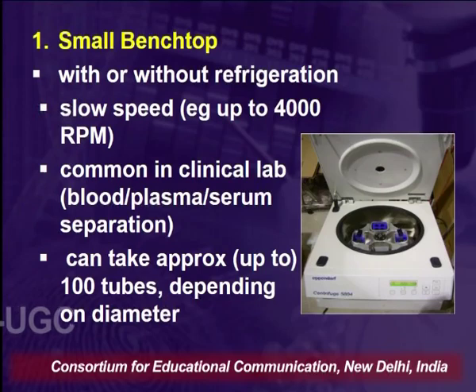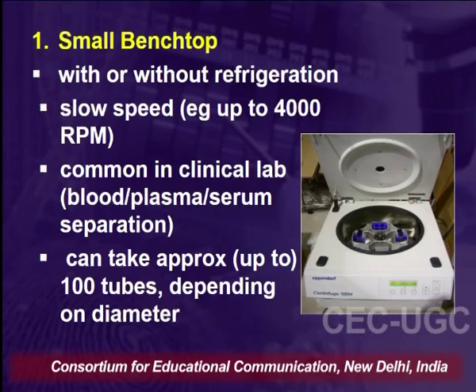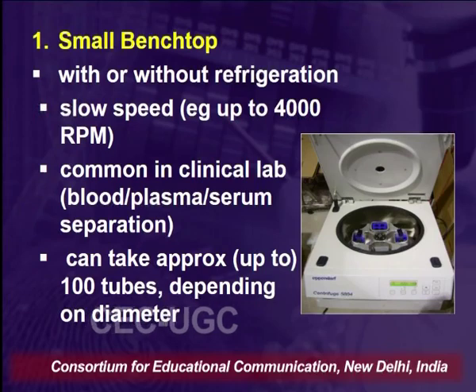Depending upon different types, the first one is the small benchtop centrifuge. This comes with or without refrigeration. There are many companies which manufacture centrifuges, many Indian companies, many foreign companies. Depending upon the company, their centrifuge comes with or without refrigeration.